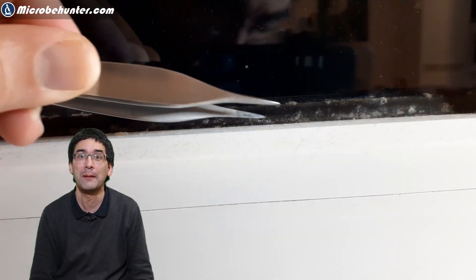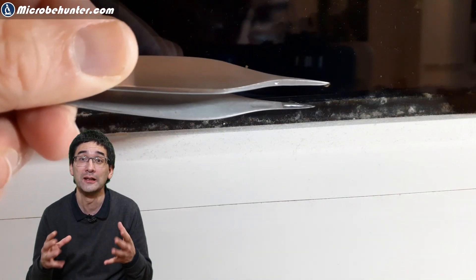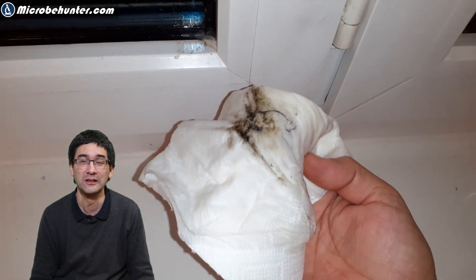Of course I had to collect a little sample. I used my tweezers, scratched some of the material off, and then put it on a microscope slide together with a little bit of water and placed a cover glass on top. Then I also had to wipe it a little bit because it didn't look very nice otherwise.